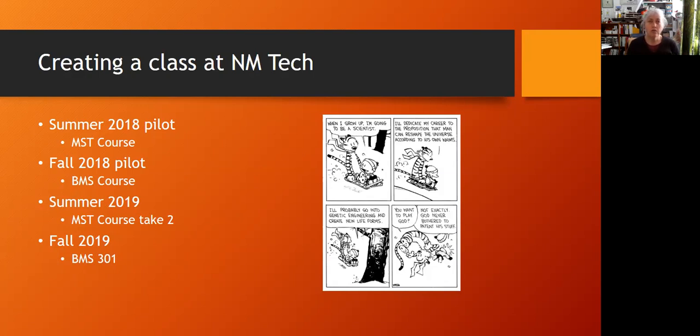This is geared towards sophomores, so they've only had 1 year of biology at this point, and it's hands-on. I run it so that once a week I have a group powwow. I give them some background into the techniques, and I give them a task of what they're supposed to do that week in the lab. And then they have to do that assignment during the week.